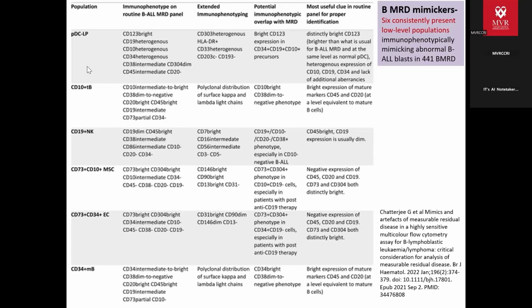Even if I want to acquire 4 million cells, I will not be able to. So in such cases, the detection sensitivity will not reach up to 0.01%. For MRD analysis, we need to acquire at least 5 lakh events. If I've just acquired 1 lakh events and I'm telling my MRD is negative, there is a chance that it could be positive, just because my event number is less, I couldn't find those positive cells. So for reliable MRD, the more the events, the better.